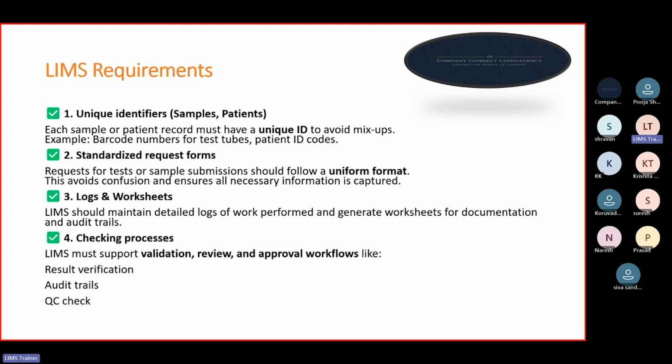There you will develop the real-time master data and test it, and after all the IQOQ is performed, the development will be moved to the production environment, which is the actual environment used by the client.